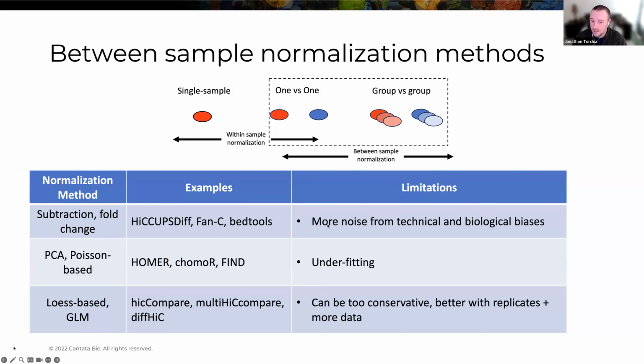So obviously, the limitation of this is you're going to find everything that's different between your samples. There's not a statistical value attached to that of significance. So you will get a lot of difference. Sensitivity would be basically limitless because you're just calculating what's the difference.